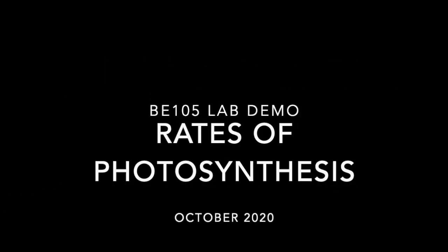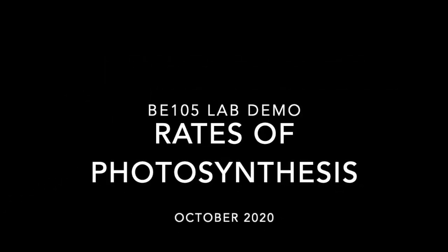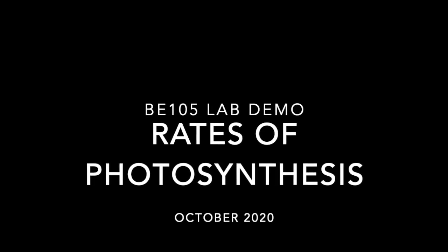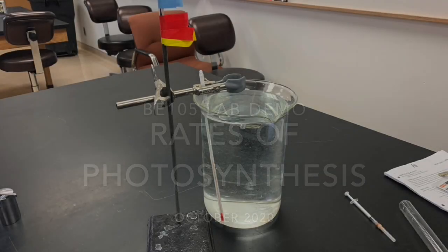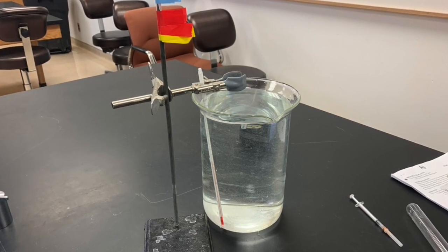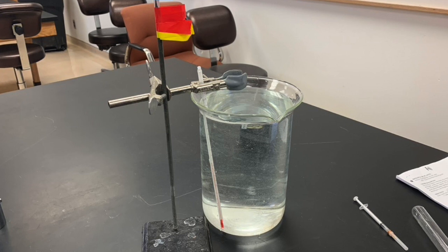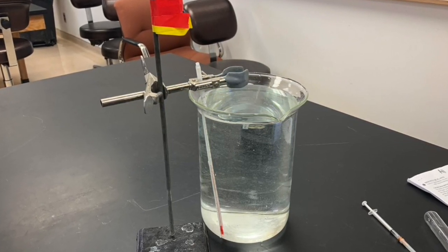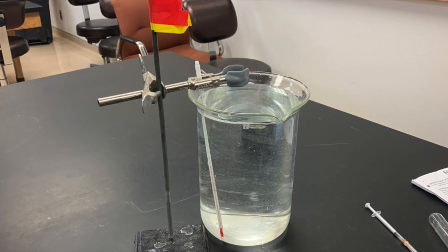Hi everyone, in this video we will be demonstrating a lab where we will look at how the rates of photosynthesis change under different experimental conditions. So to start out, we'll explain the setup of this experiment, and you can see here that we've got this large beaker filled with water, and we also have a thermometer in the water to measure the temperature.